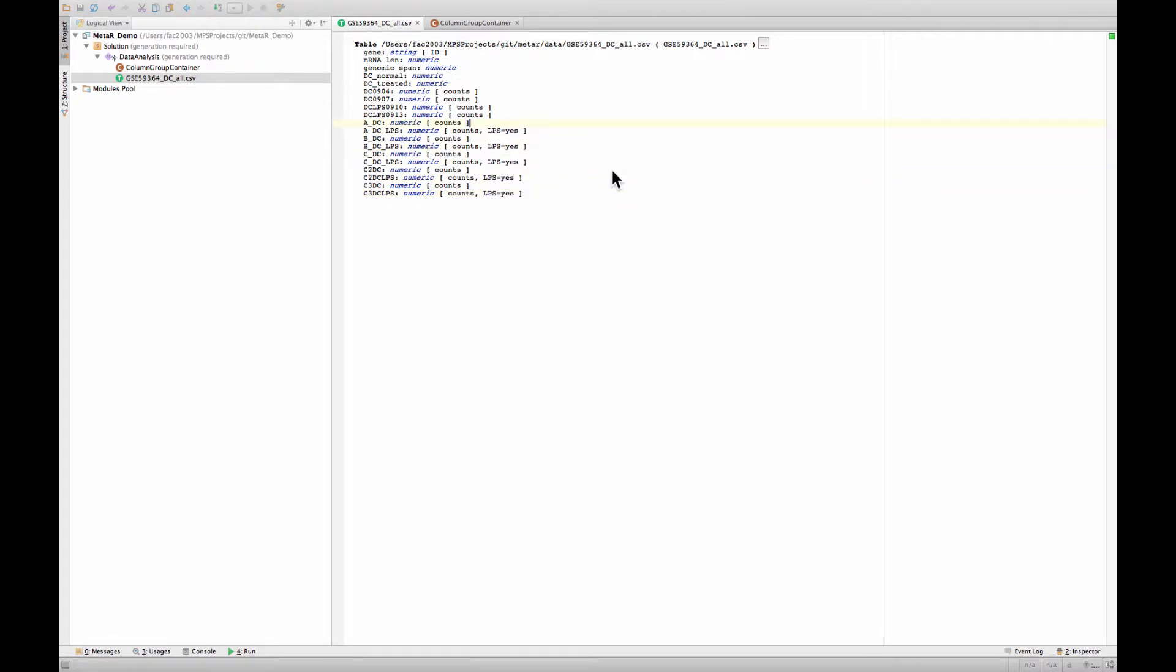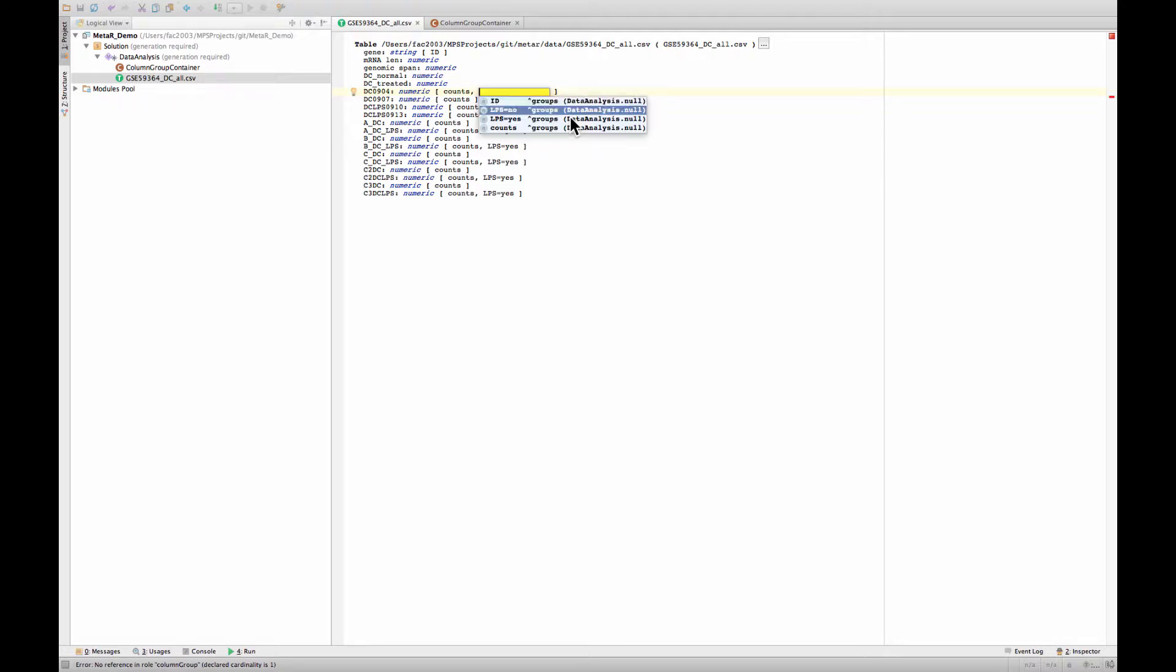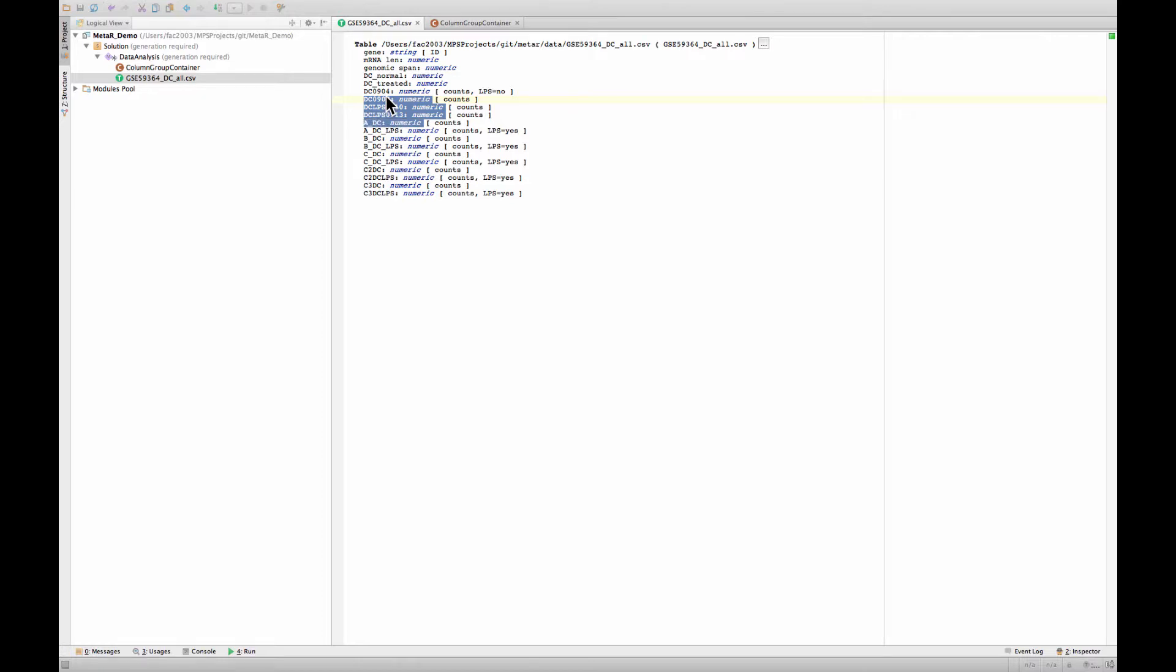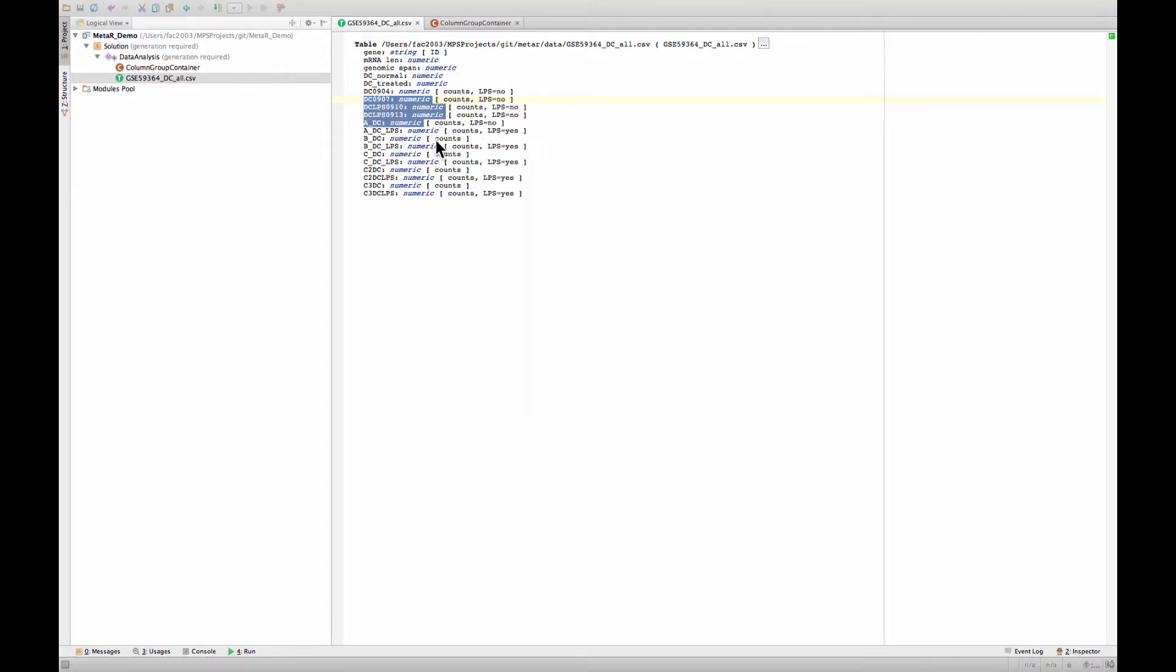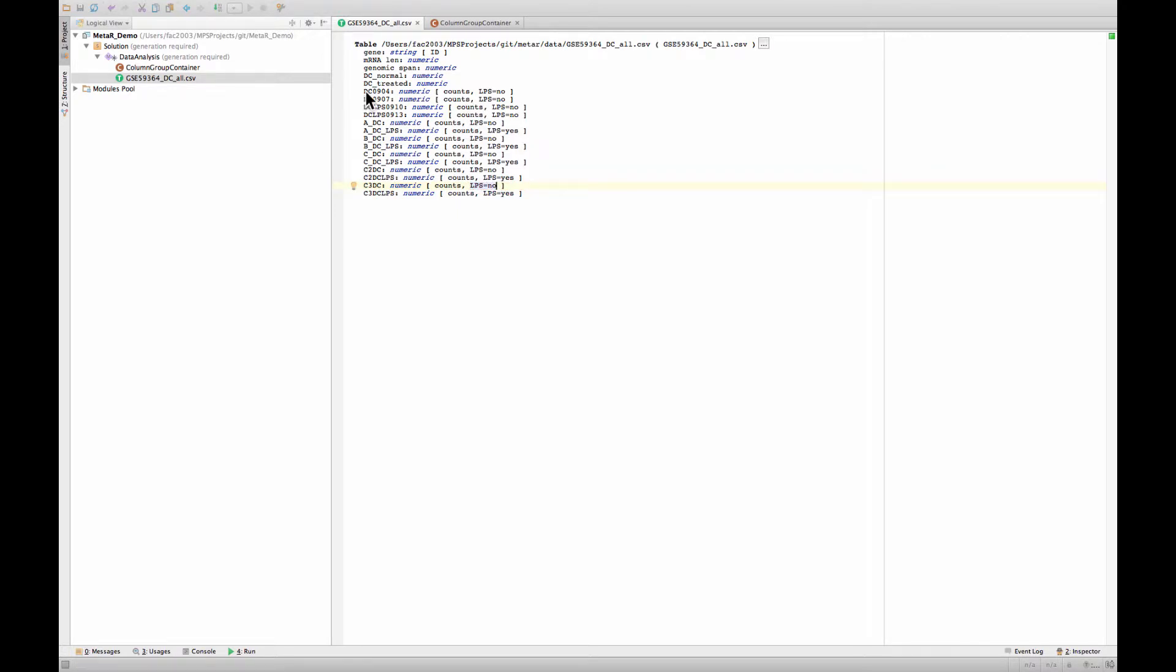We need to indicate that the other samples were not treated by LPS. And the way we do this is we select all of this, and again right-click and choose, we need to create one at least with this group and say LPS no. Now we can choose the next three or four here and add LPS no. This one will do manually, and this one also, last one. So now we have described whether each sample was treated with LPS or not.